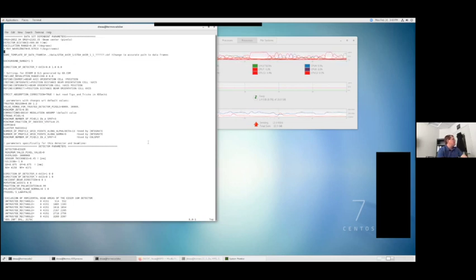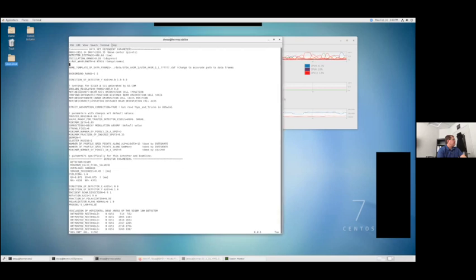So this is a Rapid XDS input file. It's got a lot of information in it, but some of the key things, so up at the top are just data set dependent parameters. So it's going to have the beam center in pixels, detector distance, oscillation range, and the X-ray wavelength, okay? It then has the name template of data frames. This is telling XDS where to look for your data.